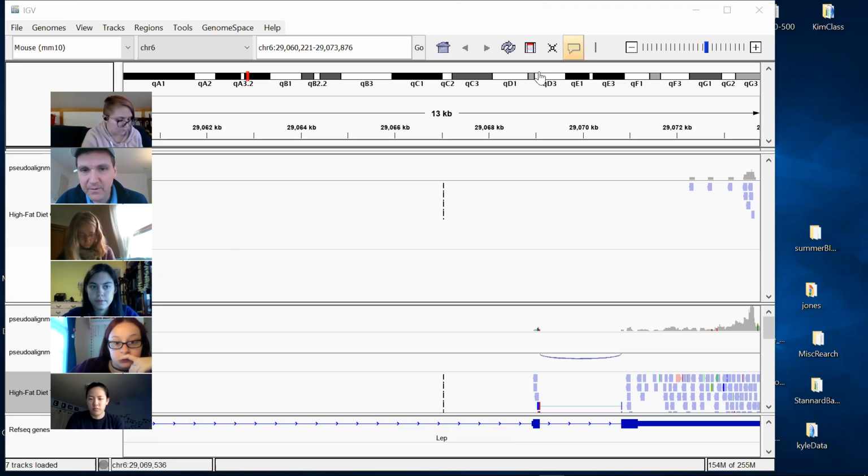I could not hear you. Okay, you can hear us. So you can communicate in the chat. Why don't you guys just let me know when you are able to upload those 2 samples and rename them.